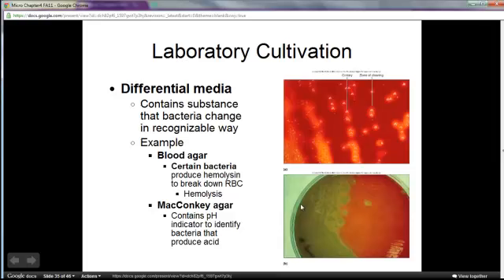So as they produce acids, the pH of the plate goes down, of course, and due to the fact that there's a pH indicator molecule added to the agar, you're going to see a change in color from this darker purple to a greenish color based upon the fact that there's more acid. And this can be useful because many of the gram-negative organisms that are found in our intestines that come out in our feces, these are commonly referred to as coliforms.